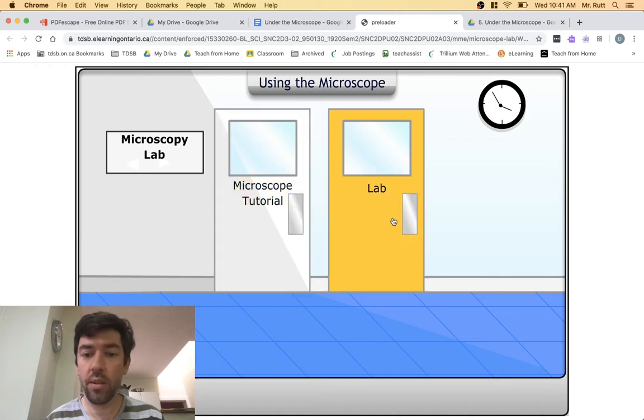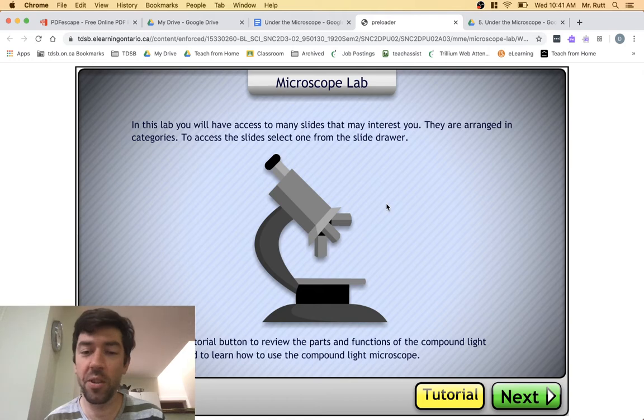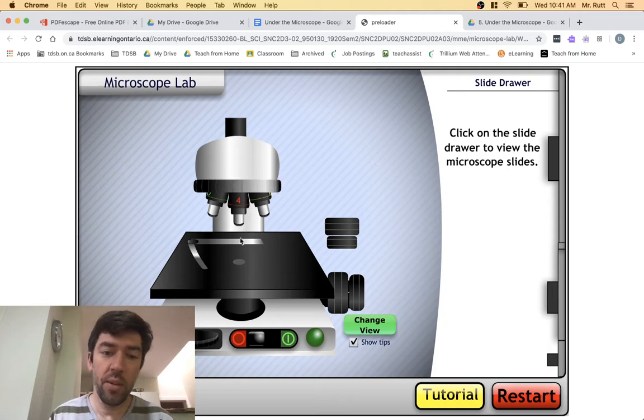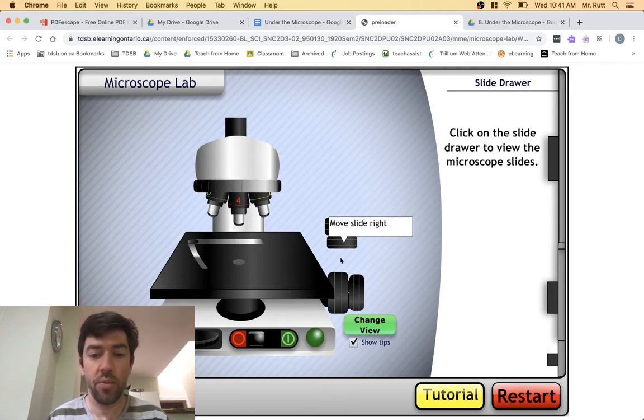We're going to go straight to the lab. If you want more detailed instructions, you can go to the tutorial and they're going to walk you through it, but I'm going to do that right now. So you can just go to lab, or you can watch this video, and then when you go here, you can go to lab. Click through all this stuff. Okay, so here's the microscope. Now, basically, you just want to get familiar with all these different controls.